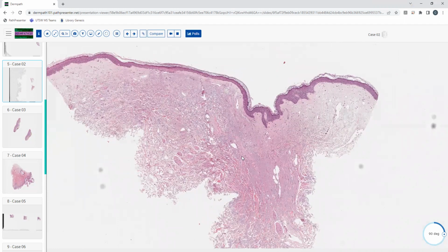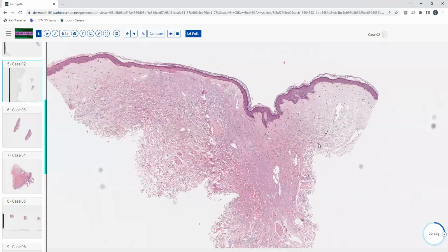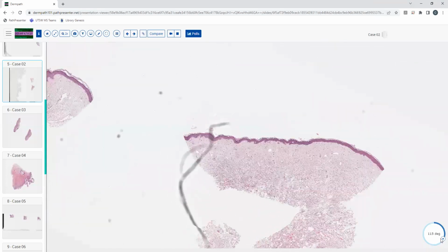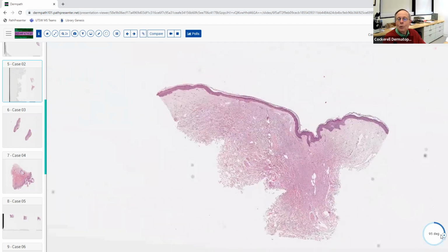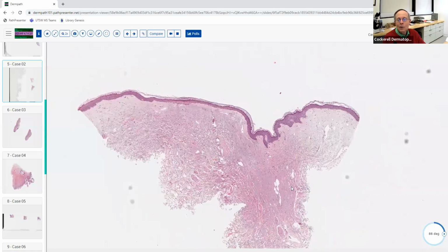So I initially thought this was a punch, and now I'm like, maybe it's a shave or an excisional biopsy. I think it probably is a punch. Sometimes if they squeeze the punch, it looks like it might be an Adson's forceps there. And the other side might look a little bit more like a punch over here, possibly. But it's got some artifact in there. So that's one of the things you have to learn in pathology, how to tune things out. A lot of extra noise. So you have to learn how to forget the artifacts and focus on the stuff that you're really interested in.